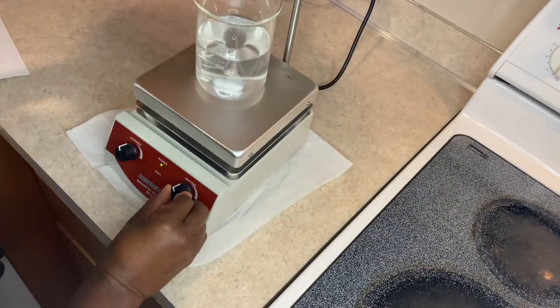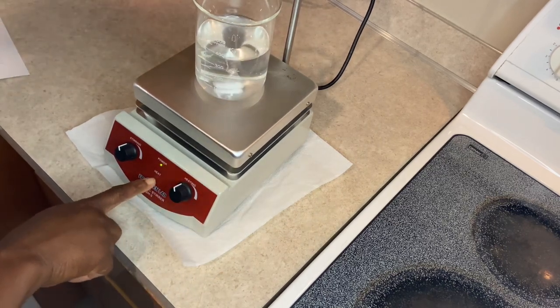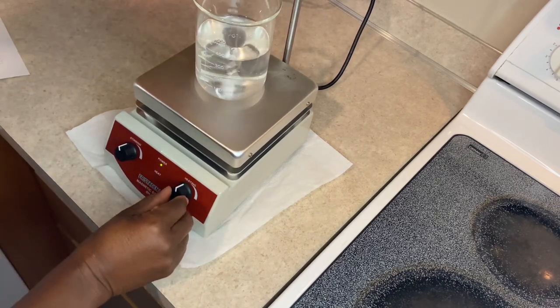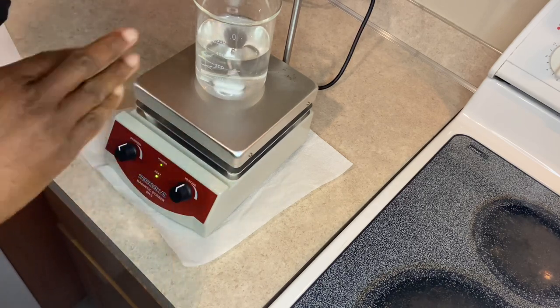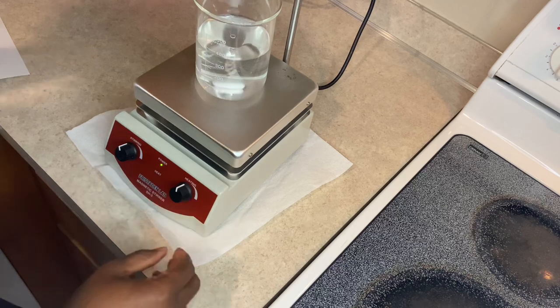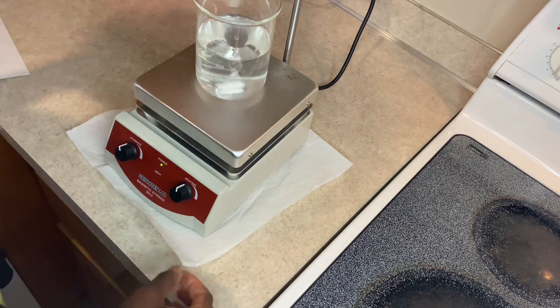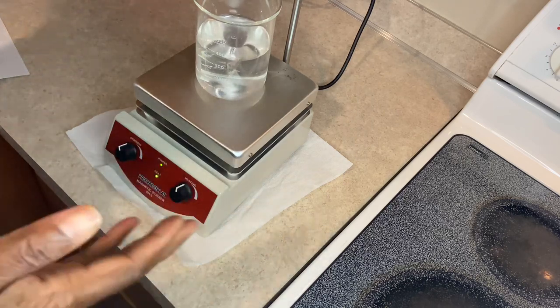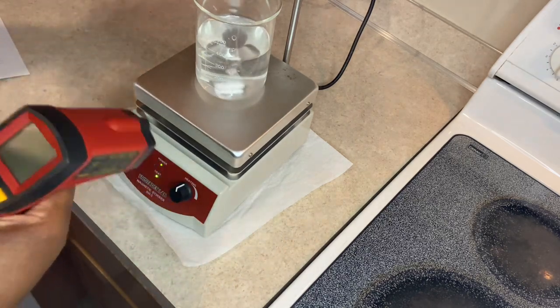So if I turn on the heat — I like that when the heat is on, this light will be blinking to let you know the heat is on, so that you know this plate is hot. And the temperature will be changing after a little bit, to start warming up. And it's stirring — I love it.